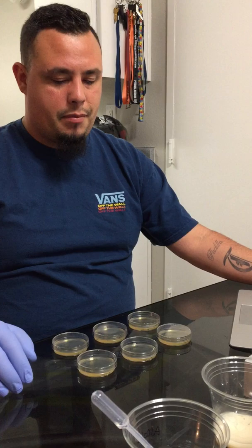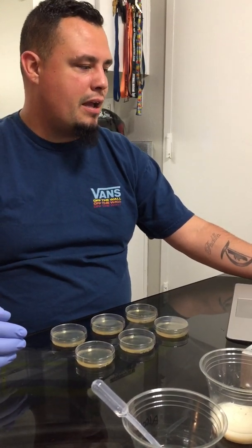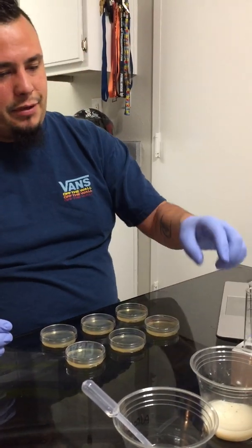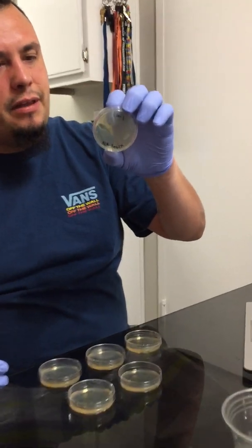We're going to be going over my microbiology week 2 lab. This is the bacterial enumeration, dilutions, and plate counts. I already went ahead and got our tubes ready. We have the tubes here and then my agar plates that I poured earlier today. They've been sitting a little bit.